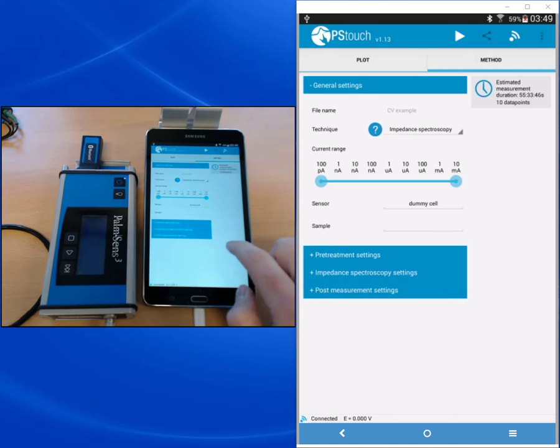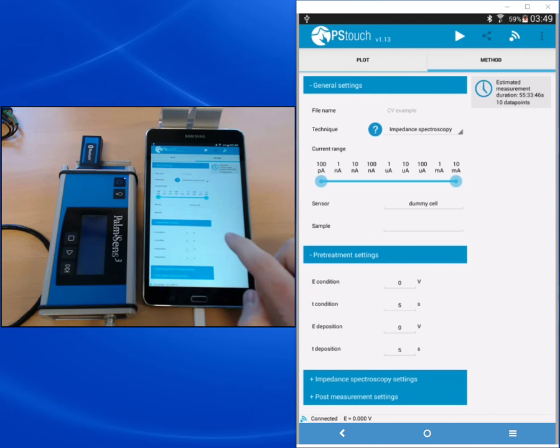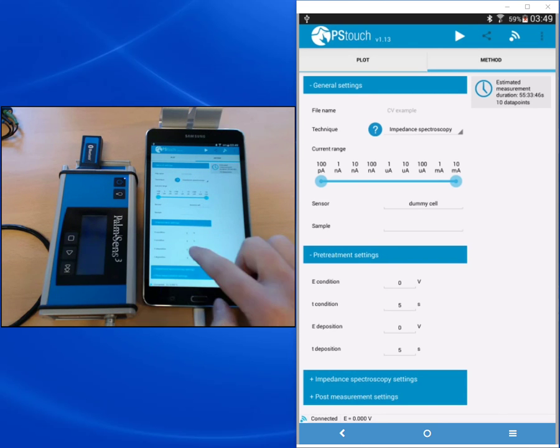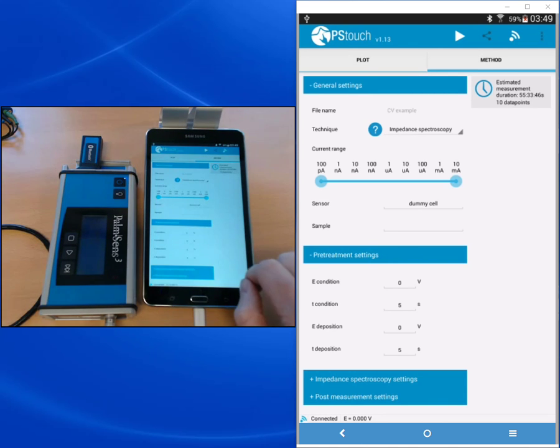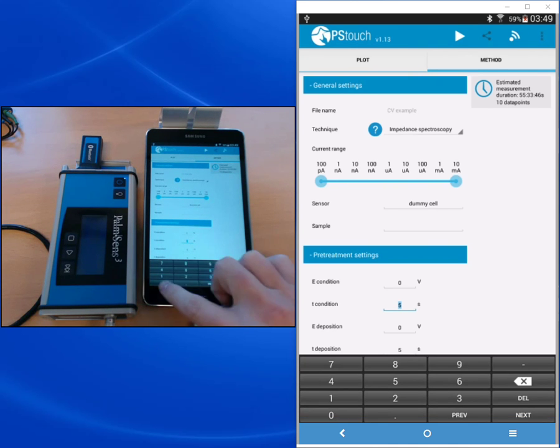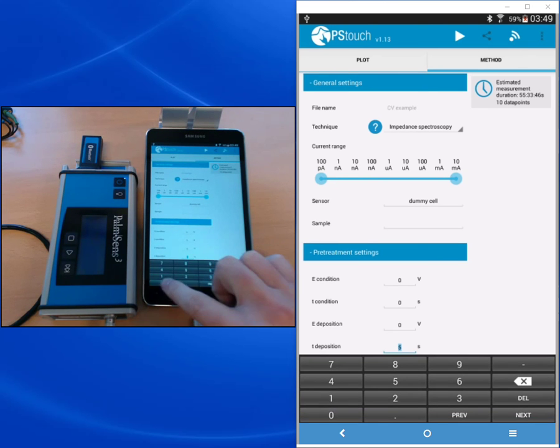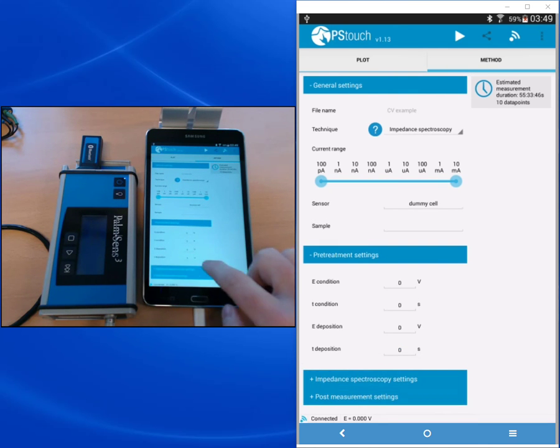Then we look at the pre-treatment settings. I don't need any pre-treatment for this measurement, so I'm setting T condition and T deposition to zero. And this step will then be skipped.